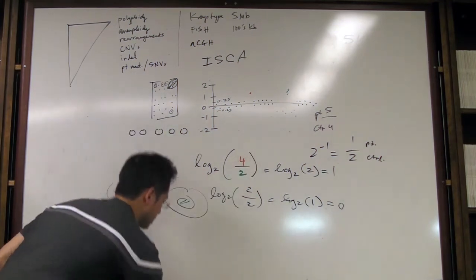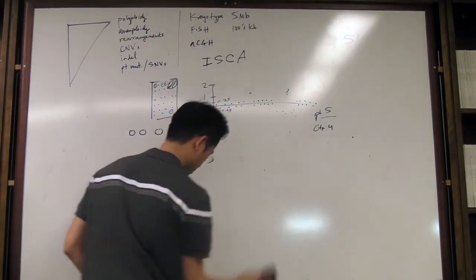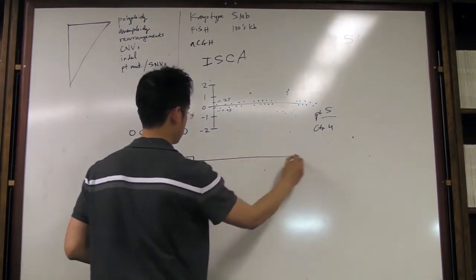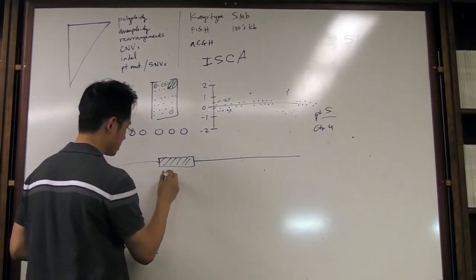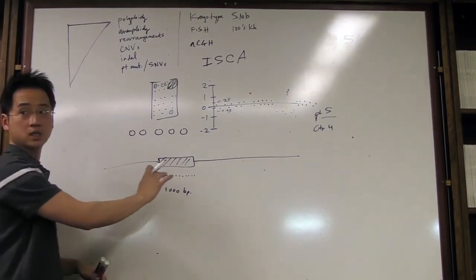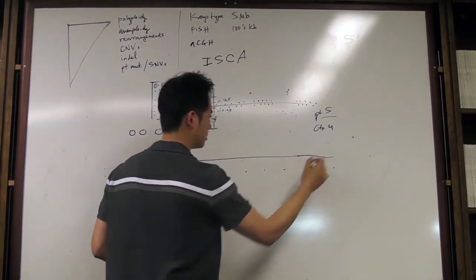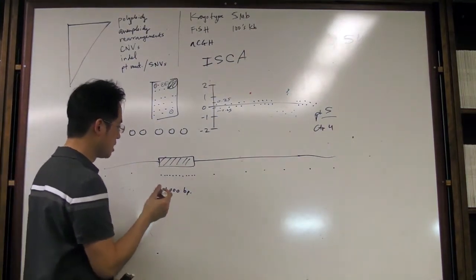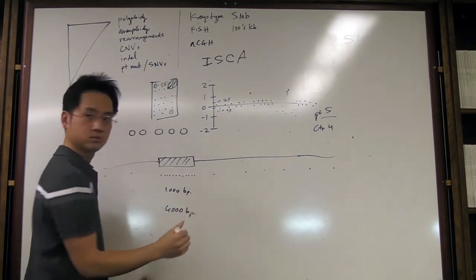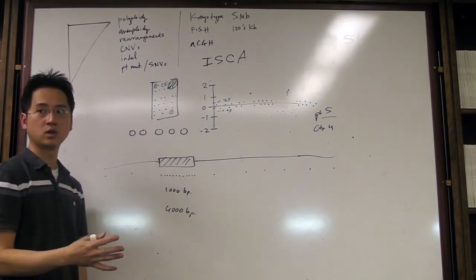So what about resolution? Where does that come into play? So if I were to design this assay, let's say here's one of my disease regions, and here's my backbone, for example. So if I pepper this with probes at every 1,000 bases, for example, along this disease region, whereas the rest of the genome, I'm doing every 10,000 bases. So obviously in the disease region, if my minimum call is based on 5 probes, then probably the resolution is around 4,000 bases, right? 5 probes, you have 4 different intervals, 1,000 bases each. Your resolution in that region is really good, very high.